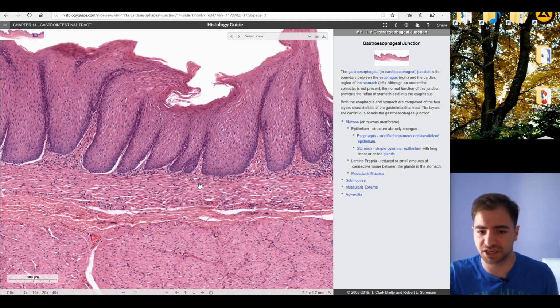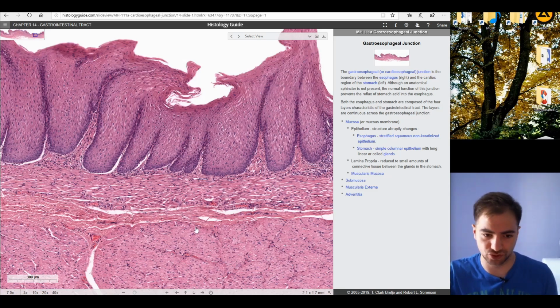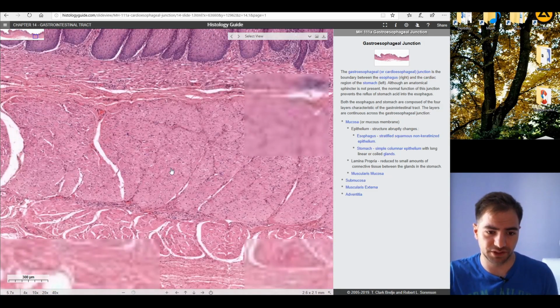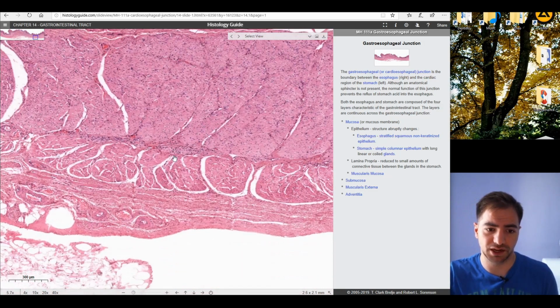In this case, we're going to find no glands, and we can see the connective tissue. Exactly beneath it, we're going to find the smooth muscle cells, the circular, and lastly the longitudinal section of the smooth muscle. Exactly, this is the circular, and this is the longitudinal section. And lastly, we're going to find the tunica serosa at the very bottom along the line of the esophagus.